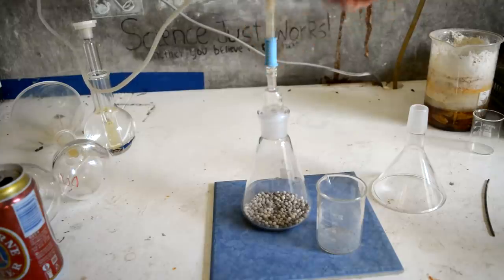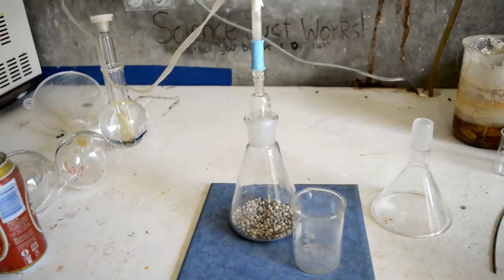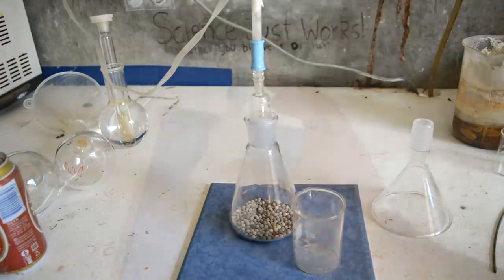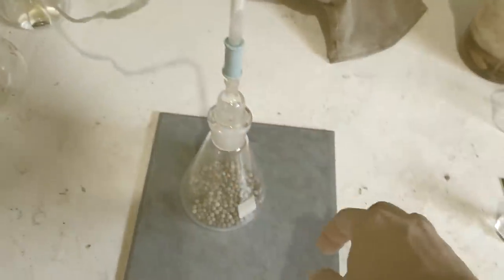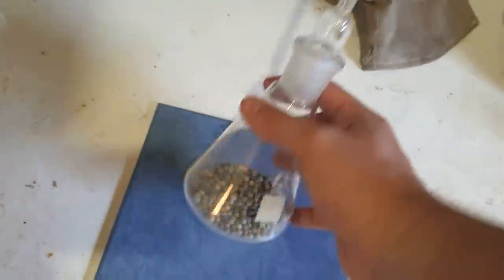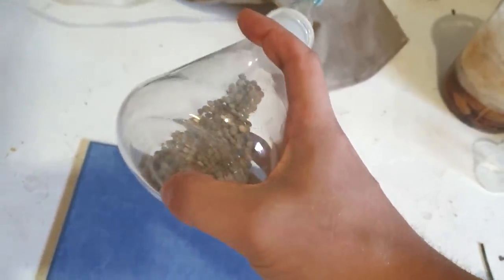Some of you were probably already about to comment, like, hey, shouldn't you not put flat bottom flasks under vacuum while they're hot? Doesn't that deform the glass? Normally I'd be like, nah, this vacuum isn't strong enough for that. It's not going to deform. It's not that hot, but look at this. Look at the bottom of the flask. It's all sucked in under the vacuum.